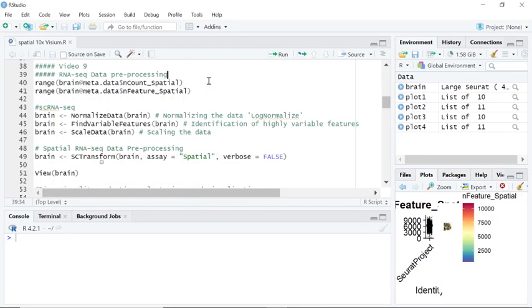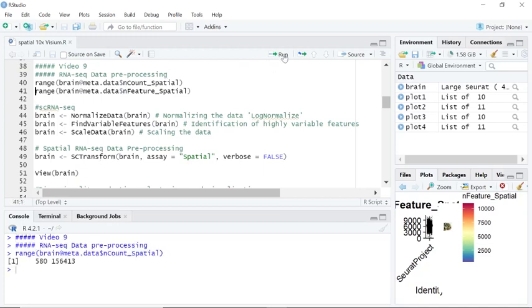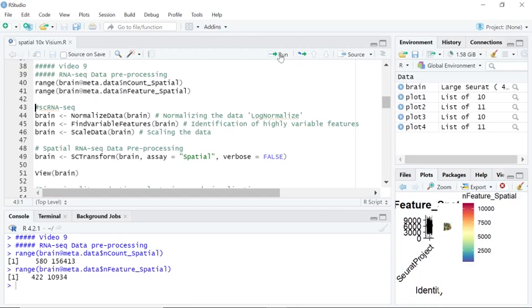Spatial sequencing data also has tissue variations, which makes it more difficult for data normalization. We can use the range function to have a look at the variation of n-features and n-count in this spatial sequencing data set. You can see down here there are big variations in the n-count and n-features.